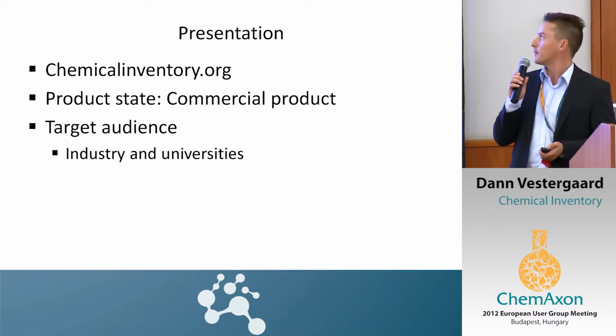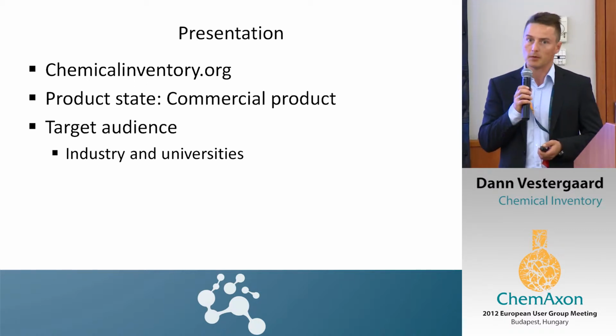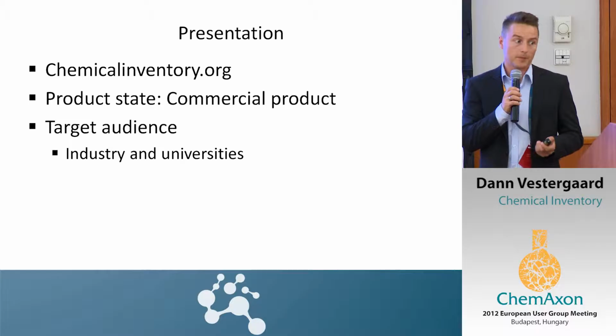Chemicalinventory is our commercial website where you can see and read a bit extra about the product. It's a commercial product, and we're targeting both university and industry together.